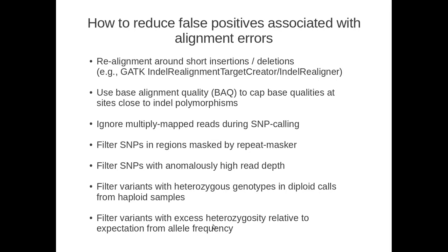Again, some of these are, I don't want to lose some of you here. I want to introduce as much as I can, some of the details and some of the complexities in the SNP calling process. But in the end, most of this is just a few command lines in a pipeline that are meant to address some of the most egregious known problems with the resequencing process. And none of this do I expect you to memorize.